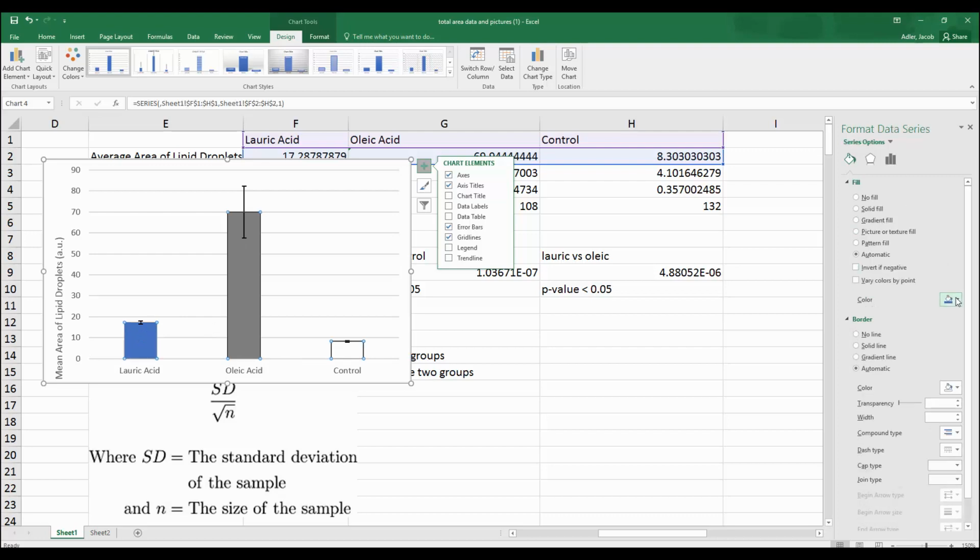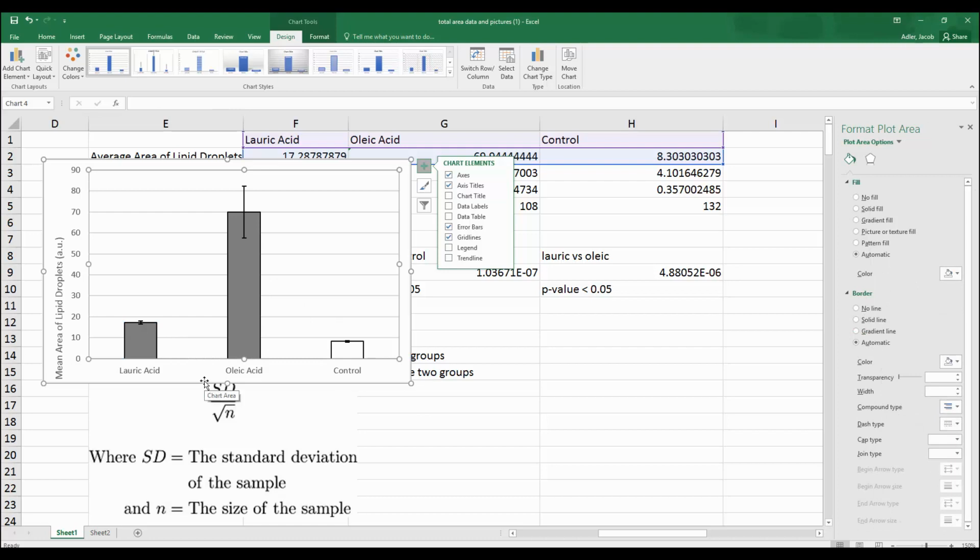The same thing over here. Maybe this one, this is our condition of interest, but just for simplicity, I would probably double click, and then maybe keep both of the acids the same.